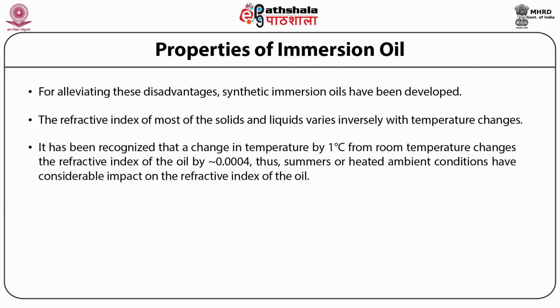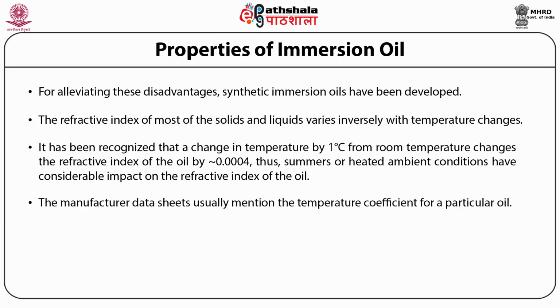It has been recognized that a change in temperature by 1 degree from room temperature changes the refractive index of oil by approximately 0.0004. Thus, summers or heated ambient conditions have considerable impact on the refractive index of oil. The manufacturer data sheets usually mention the temperature coefficient for a particular oil.